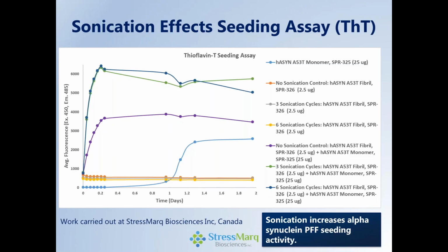What happens in terms of a seeding THT assay? If we take a fibril and carry out a normal seeding assay, such as the ones you've seen before, this is represented by the purple line in the middle, and we then sonicate at different levels. Here we have 3 sonication cycles followed by 6 sonication cycles. Very similar outcome. We can see an approximate doubling of the seeding outcome. The bottom lines here are associated with a variety of different controls, but clearly the impact of sonication allows the seeding activity to increase.